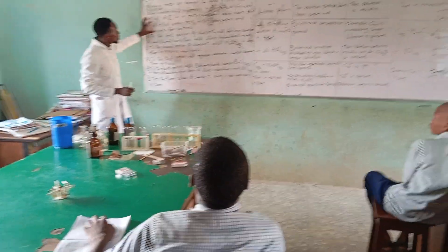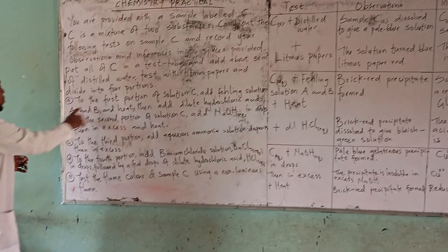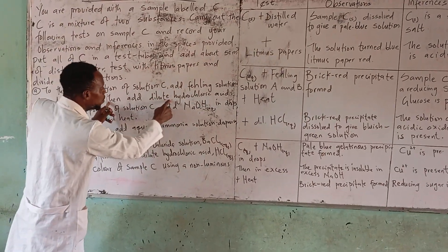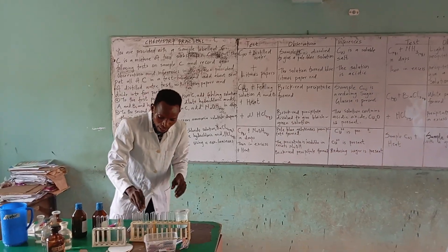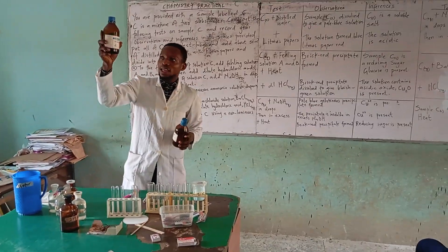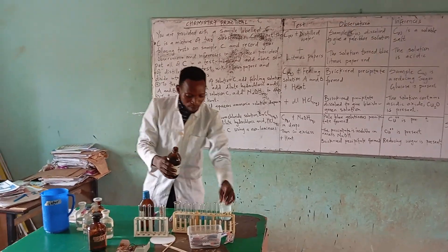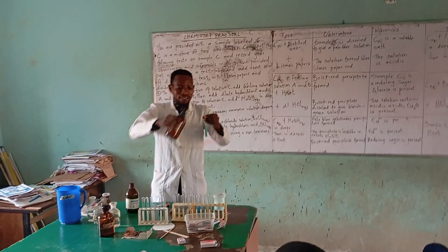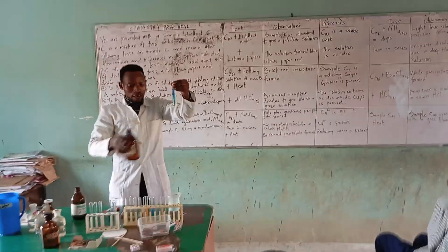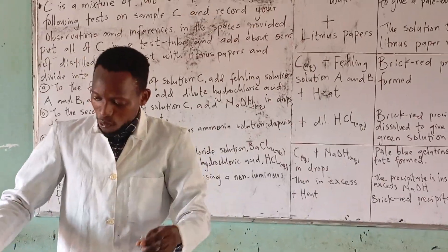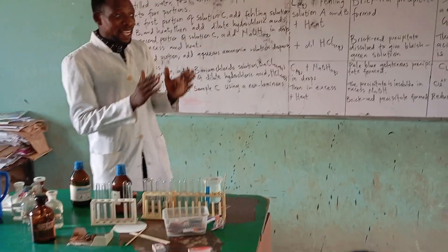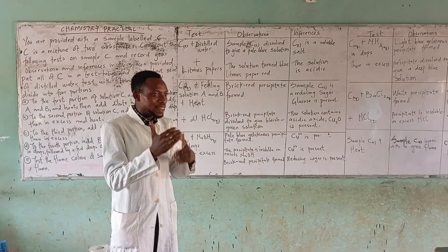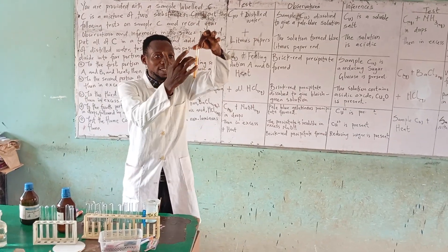We should divide our solution into four portions. To the first portion of the solution, add Fehling's solution A and B, then heat, then add dilute hydrochloric acid solution. We added our Fehling's solution A and Fehling's solution B to the sample. When you heat this sample, you are going to get a reaction. So, testing with Fehling's solution A and B and heat, you are testing for a reducing sugar.